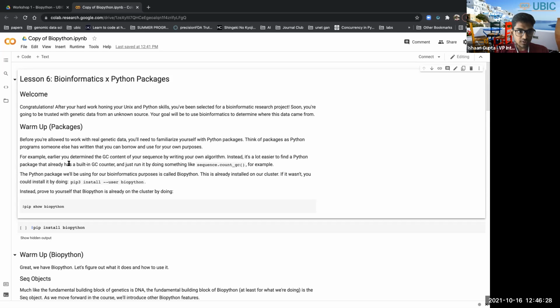A FASTA file has those DNA sequences, but it also has other lines in it. So how do you parse it without explicitly coding for it? I don't want to build the code to parse a FASTA file. I don't have time for that, and it's unnecessary. I personally once had a sequence of at least some 100,000 bases, and I had to get the reverse complement of a particular section of it.